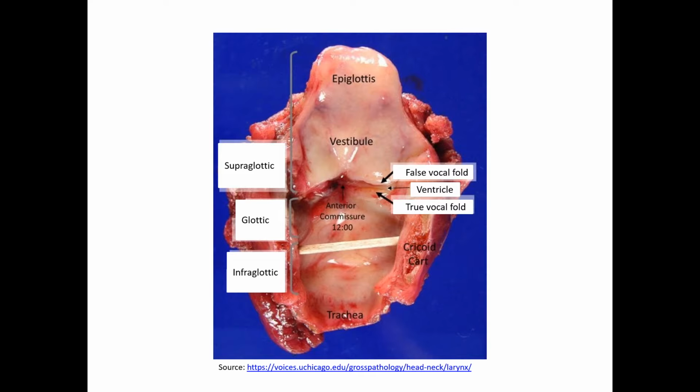It appears to be transglottic, but does it actually go up into the supraglottis or down into the subglottis? Are different structures involved? Is the cricoid truly involved? Is the hyoid bone involved? Things like that. And so each of those can have different meanings in terms of aggressiveness. But the bulk of it, of course, comes from the sampling. I can get lost very easily at the microscope if I don't understand where the tumor is going, and so understanding the anatomy is very, very important.